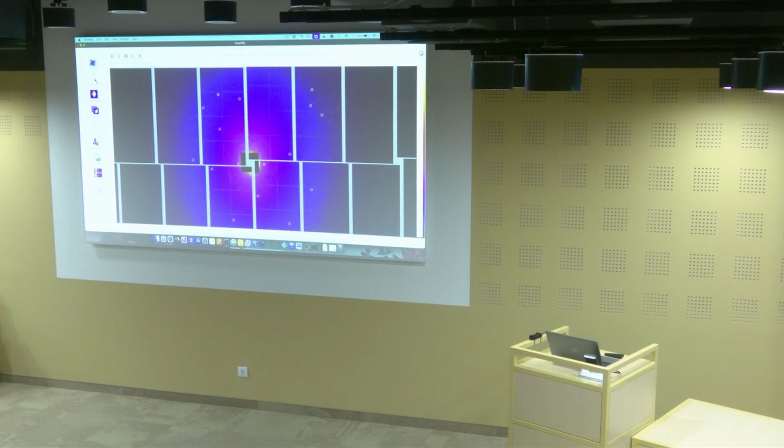And we press peak detection, where we can find different parameters to change and to play with to find the best peaks. The aim is indeed to select most of the peaks, but what's more important is that you don't select any noise. So you try to play a bit with the parameters so that you find most of the peaks, but if you're going to select noise as peaks, then this will probably mess up your indexing and it will decrease your success rate.